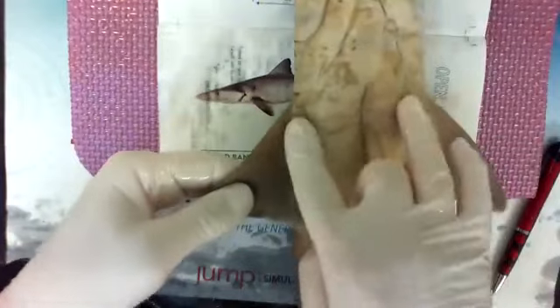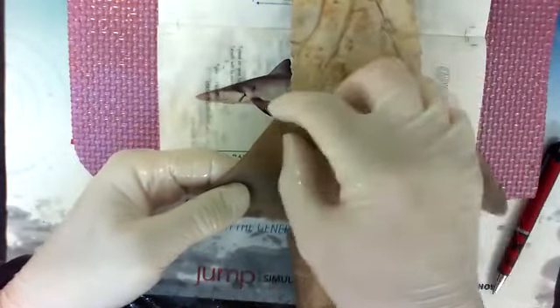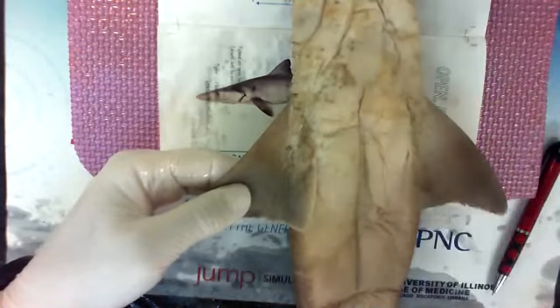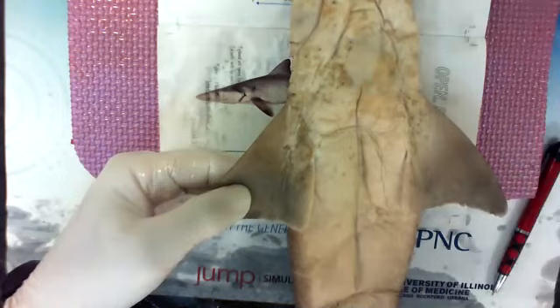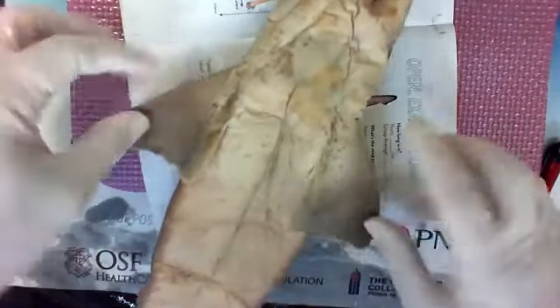So in us, we have two muscles on each side. We have a pec major, pectoralis major, that goes across on this side and this side, and then a minor one underneath. Major just means bigger, minor means lesser. Okay. So pectoral fins are the ones that attach to the pectoral region. Here are your pectoral fins.